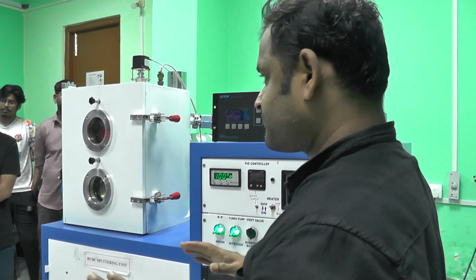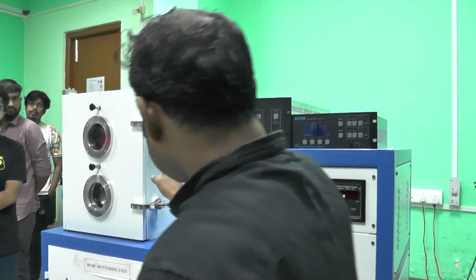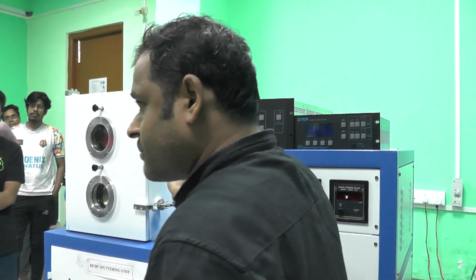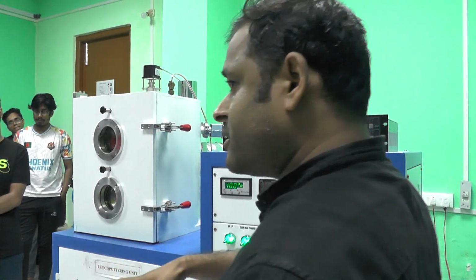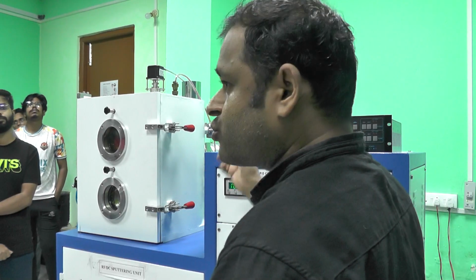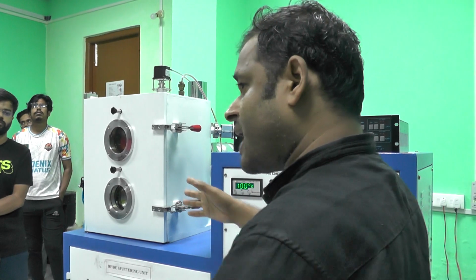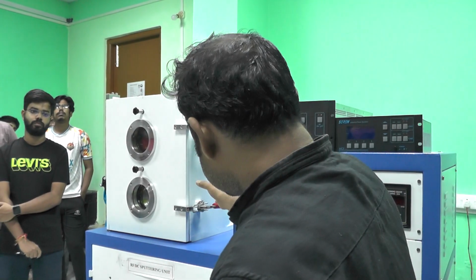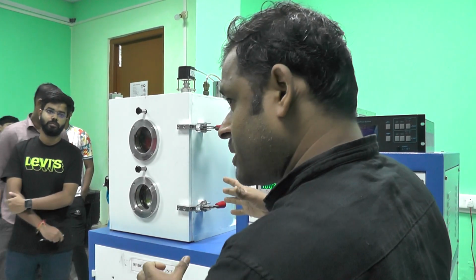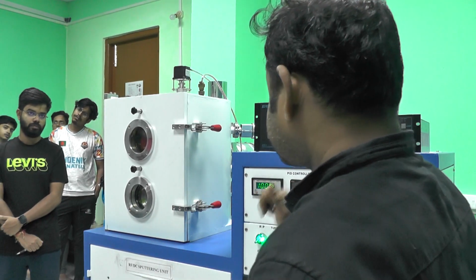First we have to open the roughing valve. It will bring the vacuum level to a medium level, and after that we open the vacuum valve. What is the use of the vacuum valve? It isolates the low vacuum from the high vacuum level.